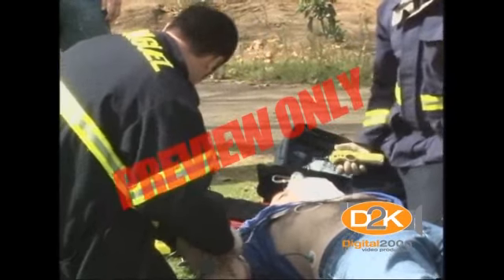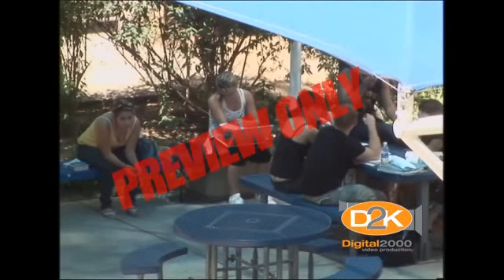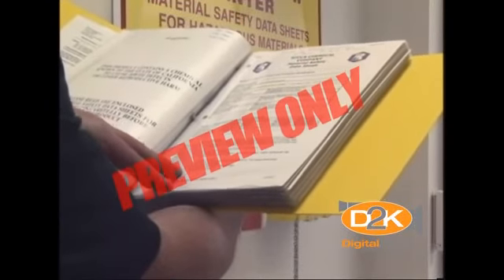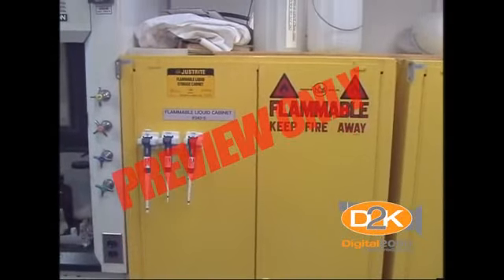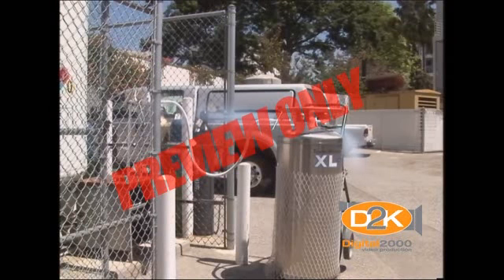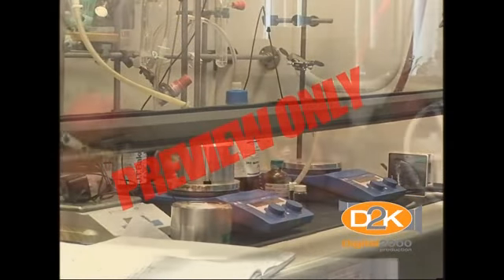Sensitization is an immune response to hazardous substances in susceptible individuals. It is possible to be allergic to a variety of substances and chemicals. The MSDS indicates whether a chemical is known to be a sensitizer. Hazardous chemicals include explosive chemicals, compressed gas cylinders, flammable chemicals, reactive chemicals, oxidizing chemicals, organic peroxides, corrosive chemicals, cryogenic liquids, and dry ice.